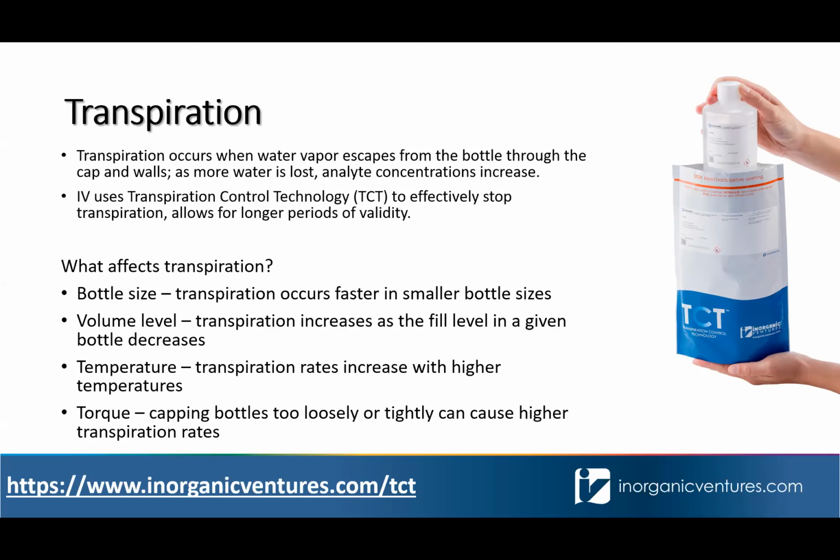This happens around the cap as well as through the walls of your container. What you see as a result is a systematic increase in concentration over time. So at some point, you'll exceed the uncertainty component on the certified value of your solution as your bottle transpires over time.